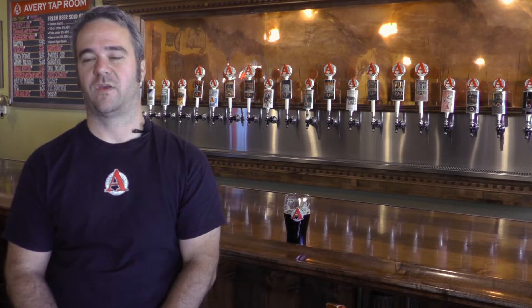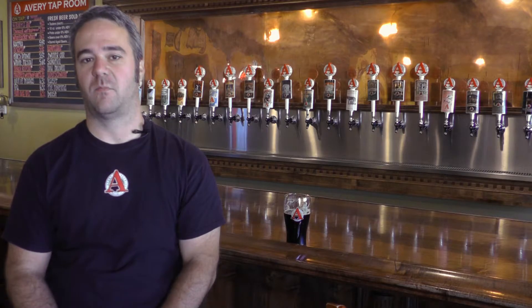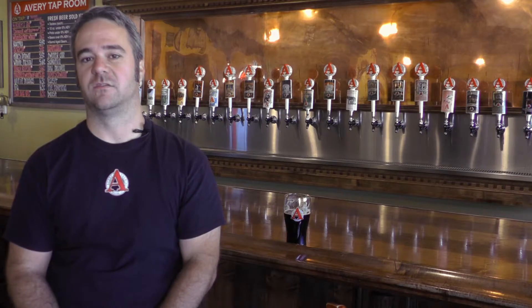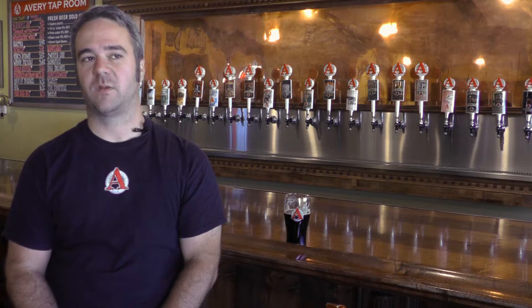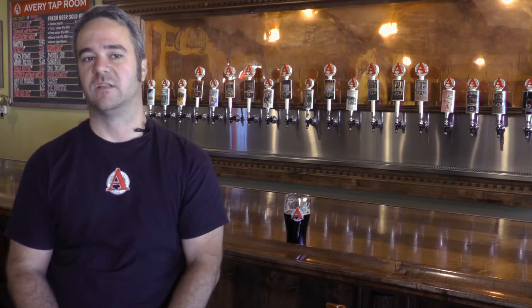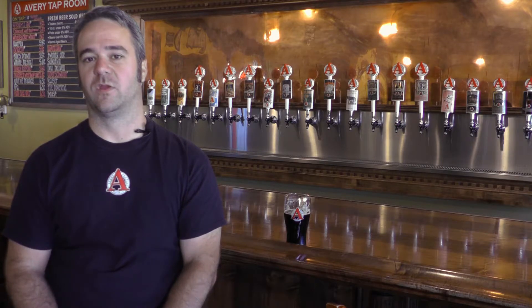Hi, I'm Rob Christensen, the Quality Assurance Manager at Avery Brewing Company. In 2010, we started a full-time lab program which included all aspects of brewing science — analytical and microbiological. One of our first purchases was a DR5000 spectrophotometer from Hach. We bought it initially because we knew it was one of the least expensive, most useful analytical tools you could have in a brewing lab.